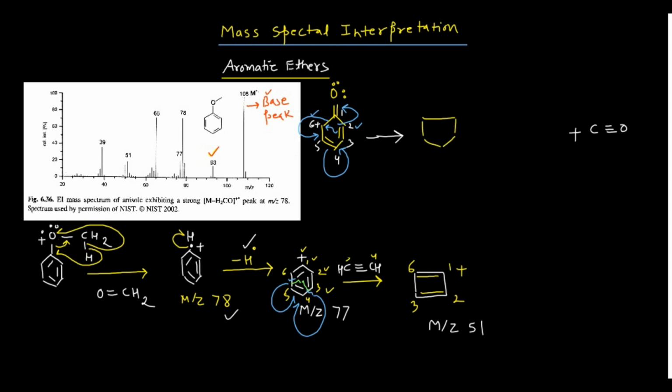So I am writing these 5 carbons just like that. If you want to number, this is your carbon 2, this is your carbon 6, this is your carbon 5, this is your carbon 3, and this is your carbon 4, and you have removed carbon 1 from here.